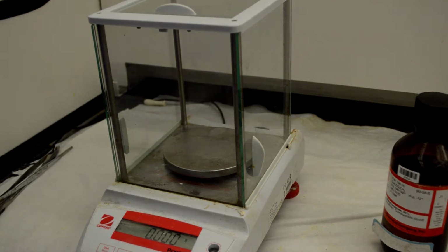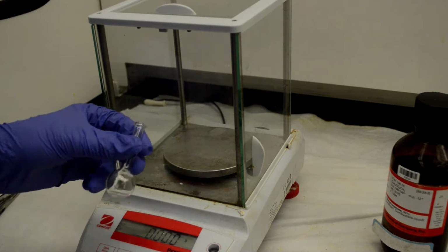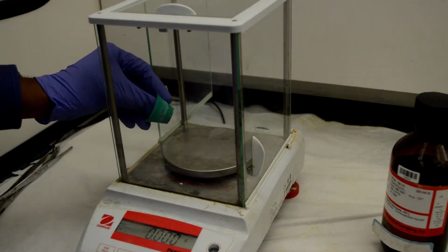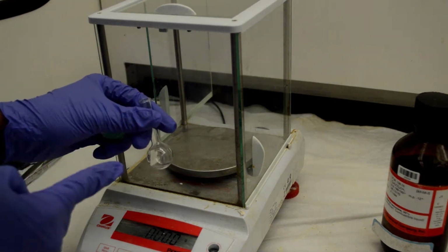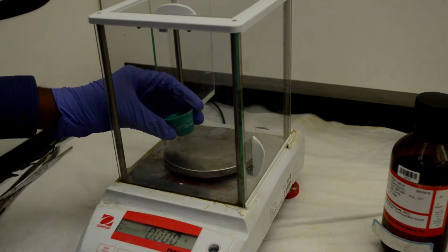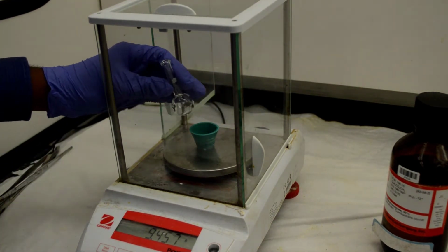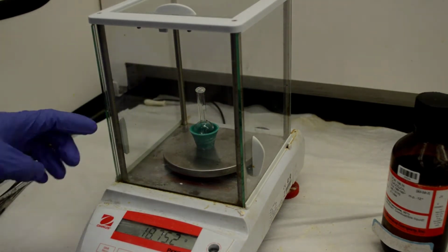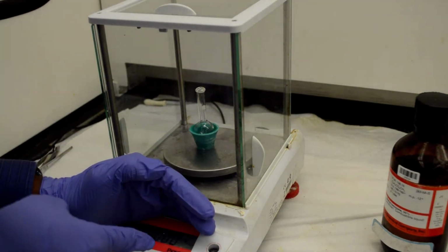Nitration of methyl benzoate. We're going to use a round bottom flask for this reaction. Let's zero the weight of this round bottom flask. I'm going to put a holder like this and put the round bottom flask upright here and zero down the weight. Hit the tare button. Alright, that's 0 grams.